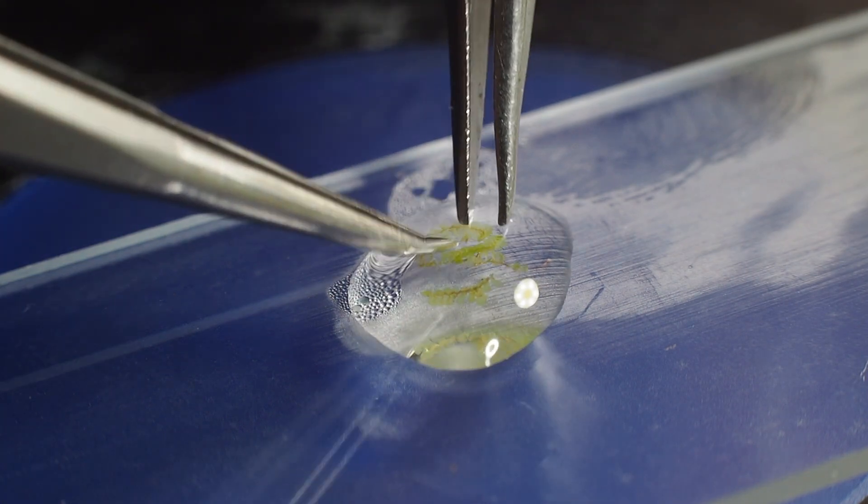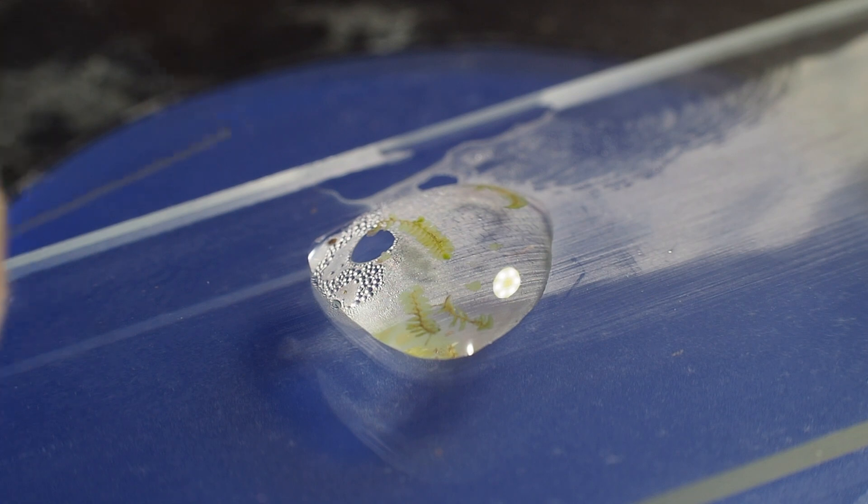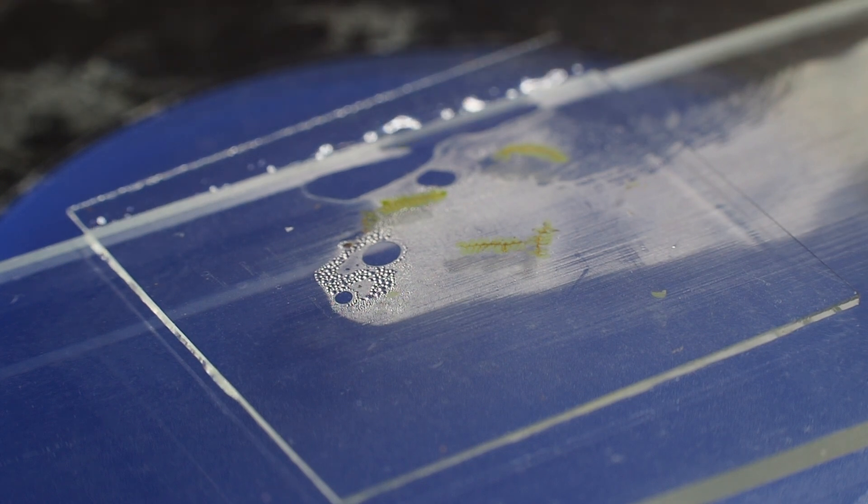To view them, put them on a slide with a drop of water and cover them with a cover slip. Now they should be ready to see under the compound scope.